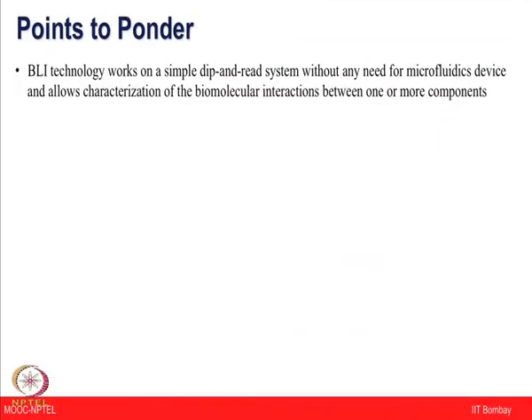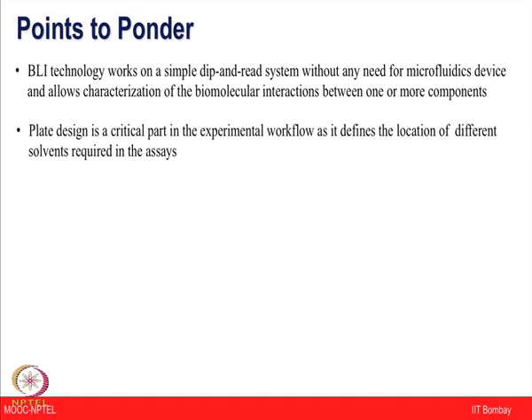Now we have successfully demonstrated the protein-protein interactions here, with protein A and the mouse monoclonal antibodies we used, and we got very good data with the 1:1 binding model, with affinity around the 1.7 nanomolar range. So with this I am concluding my demonstration.